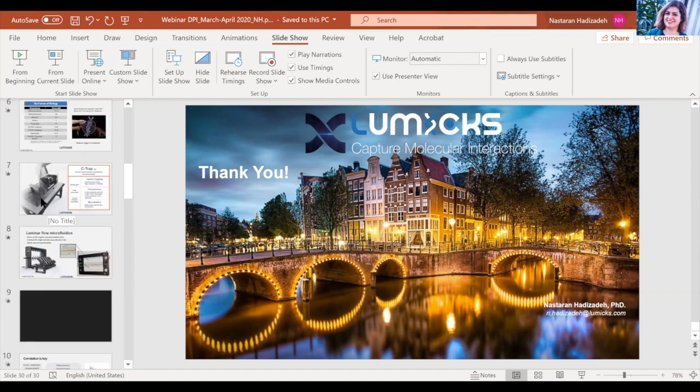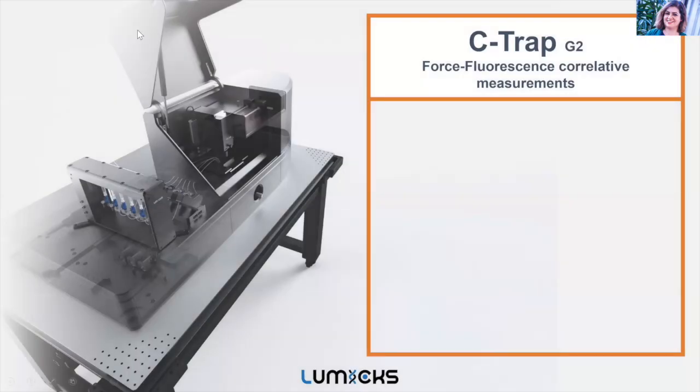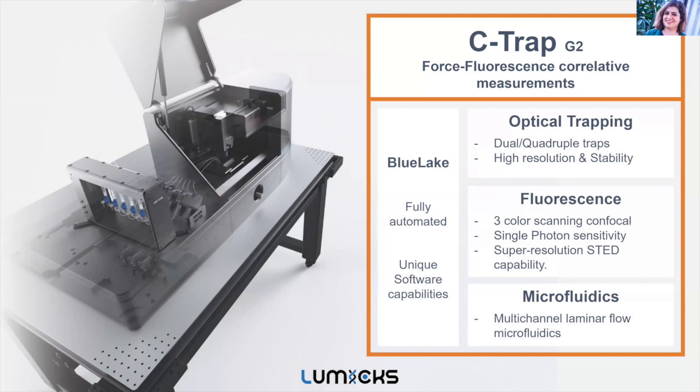I hope it's clear. So here you can see the lid that can be completely closed. You want that for other safety reasons, because you're working with IR lasers. There are all these safety features, so when you open the lid, the IR laser shuts off. But you usually have the lid closed. I don't know if that answers your questions or not.